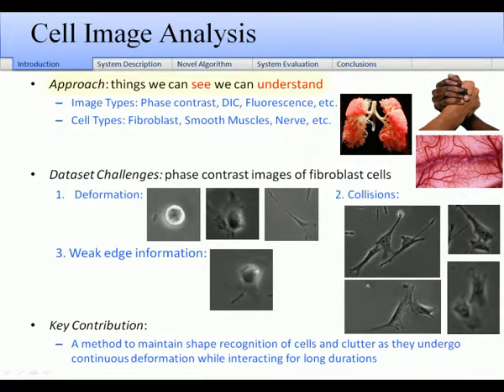To address questions including how does our body form structures such as our skin, blood vessels, or lungs, many researchers are running on the assumption that the things we can see, we can understand. Using various image acquisition technology, they are recording the building blocks of life in action, cells. Then researchers analyze the thousands of images, showing how populations of various cell types behave under a variety of environmental conditions, hoping to discover models explaining how body structures form.